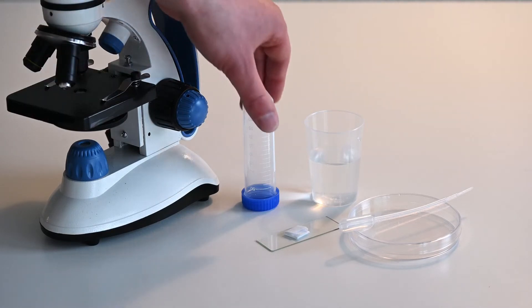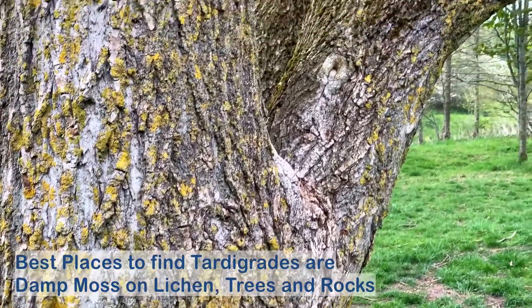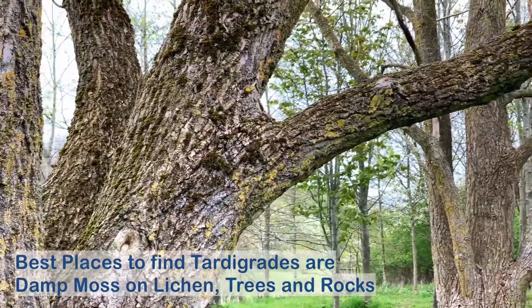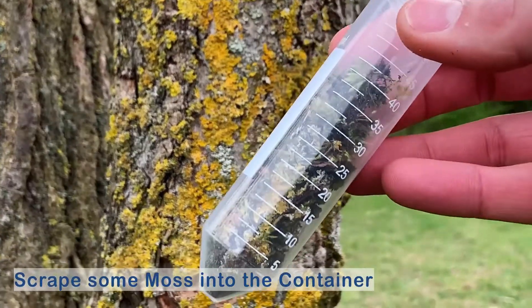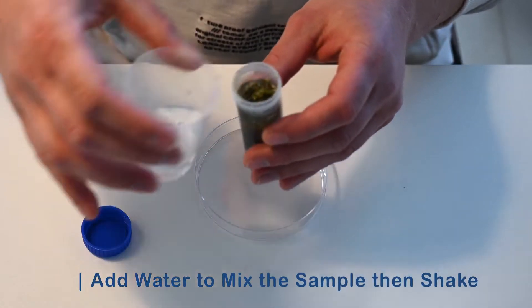Now we just need a sample with some tardigrades. One of the best places to find tardigrades is moss and lichen on trees and large rocks. When you find a good place to take a sample, scrape some of the moss and lichen into your container. Now we have our sample and just need to add a bit of water and shake it for about 10 seconds.